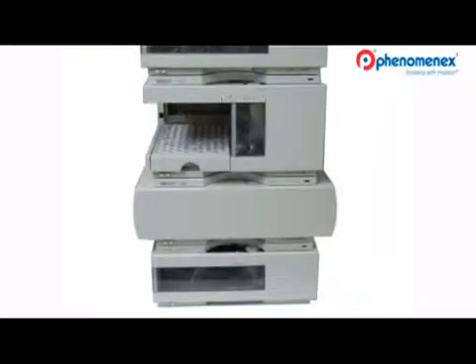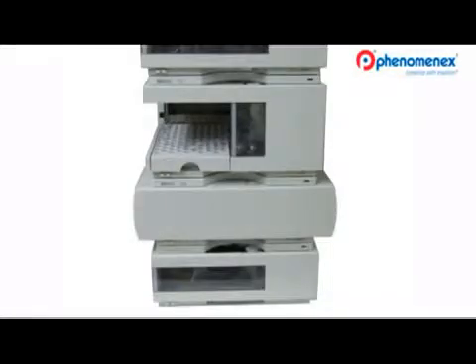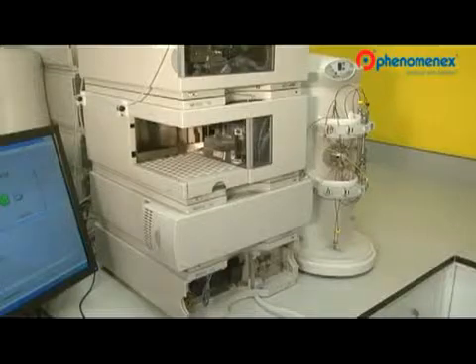You must minimize system volume using smaller diameter connective tubing. Tubing may run from the autosampler to a column heater and finally to the detector. I will also have you change the injector needle seat to a lower volume model. I call these changes Phase One — they are easy, inexpensive system improvements for Kinetics core shell.